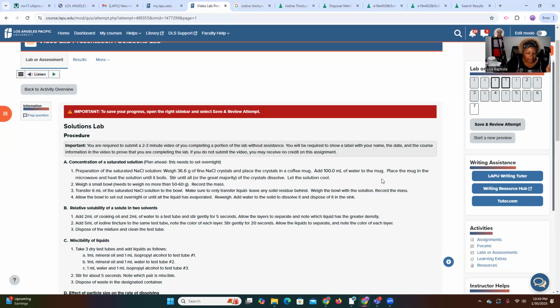Okay. Beakers, although they have measurements on the side of them, are not accurate for measuring volume. And so you always want to use your graduated cylinder to measure your volume. All right. And so it doesn't matter for this particular experiment whether it's tap water or bottled water, it doesn't matter. Okay. Tap water is perfectly fine.